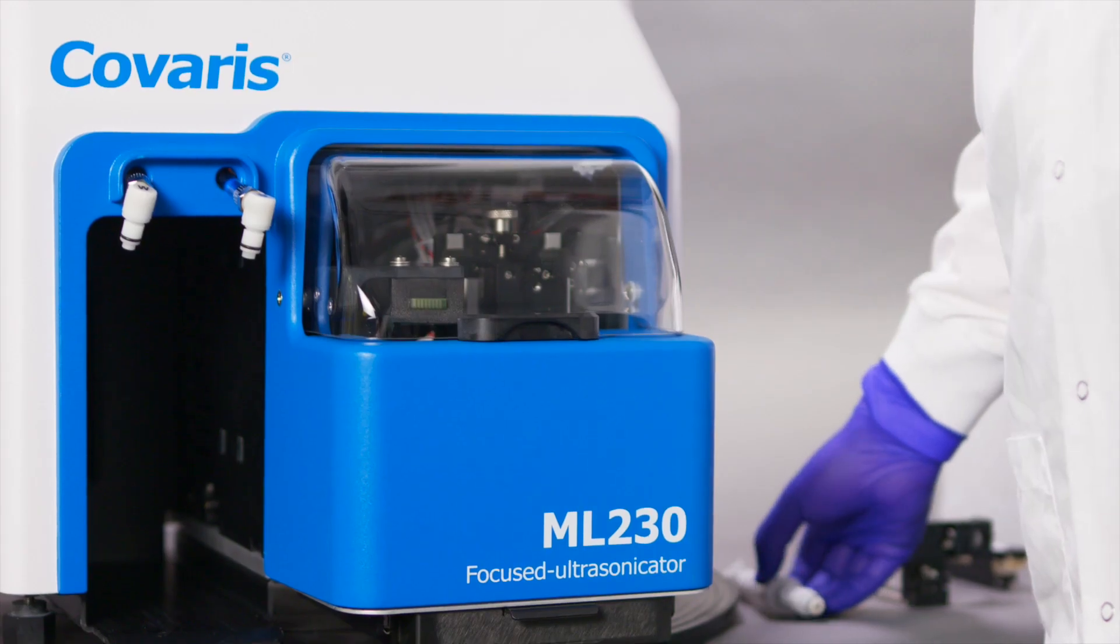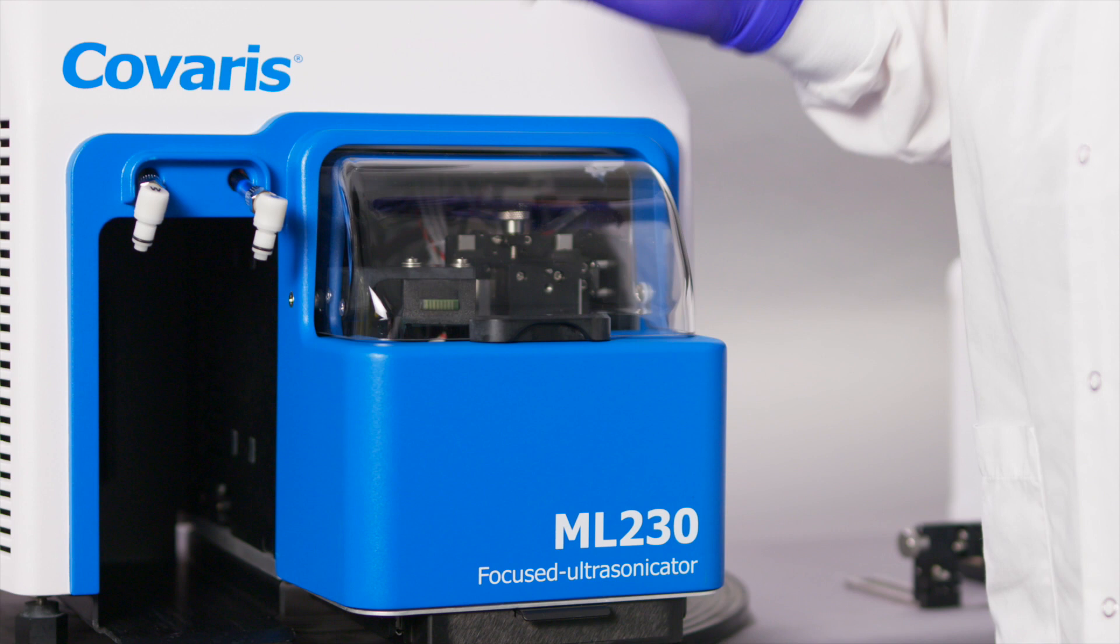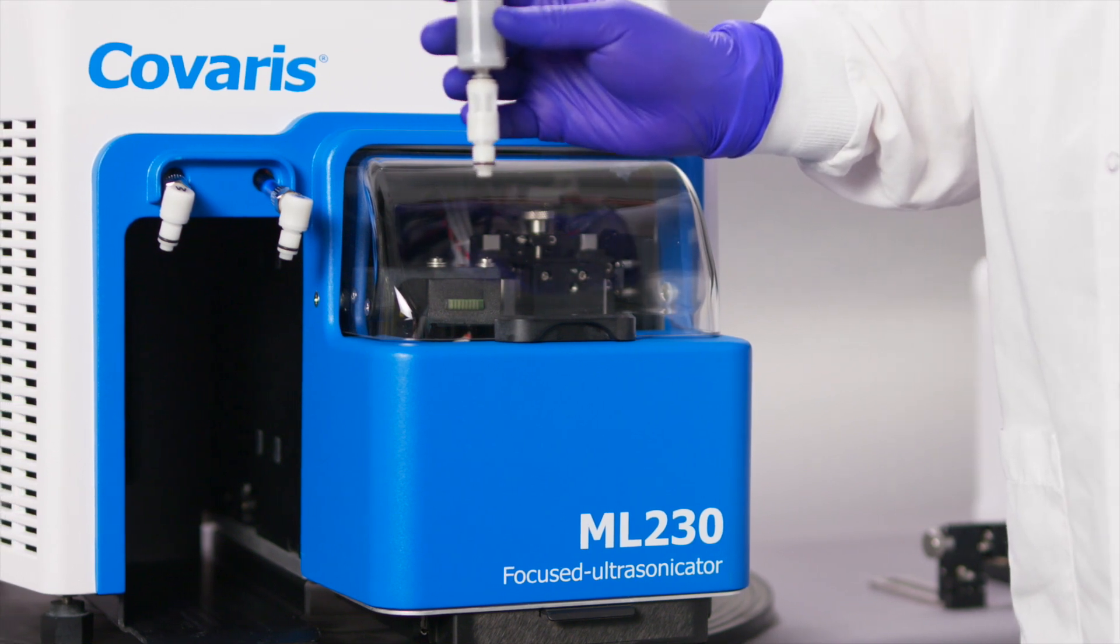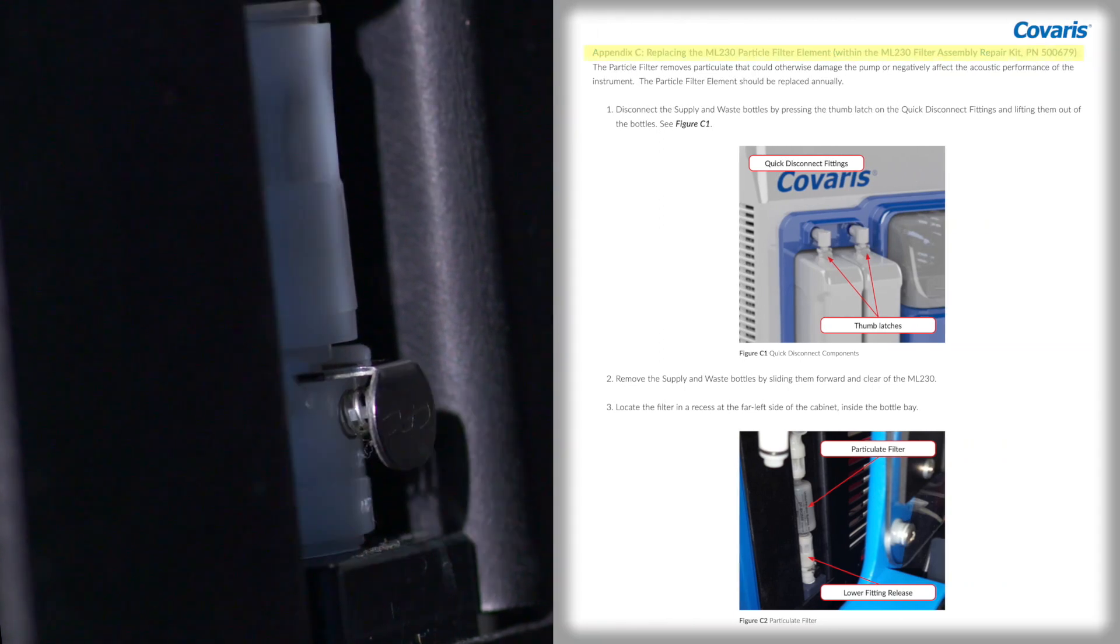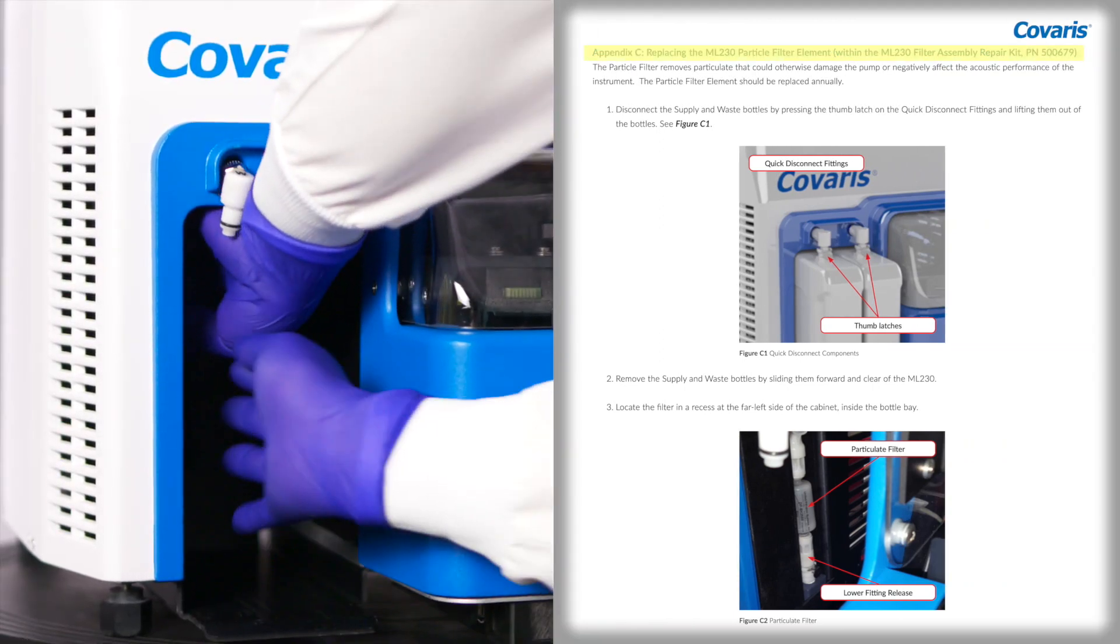Before the supply and waste tanks are connected, check to see that the particle filter is already installed. If not, please refer to the ML230 User Manual for instructions on how to self-install.